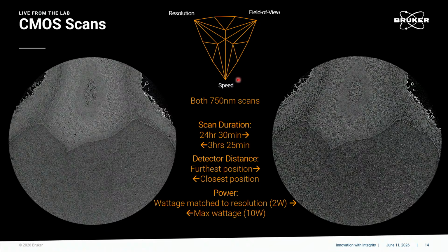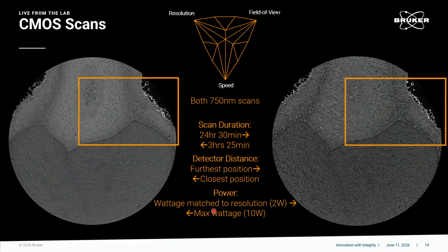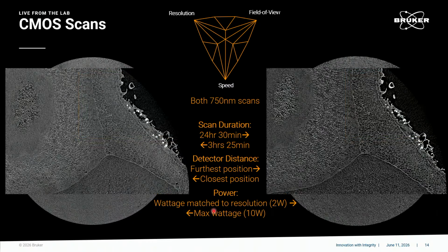What we thought was a homogeneous matrix material, now that we're seeing, let's zoom in, it's really all microporosity. So there's a lot of structure. For me, it was the structure here and here, and then this was the biggest one, I think, for me.